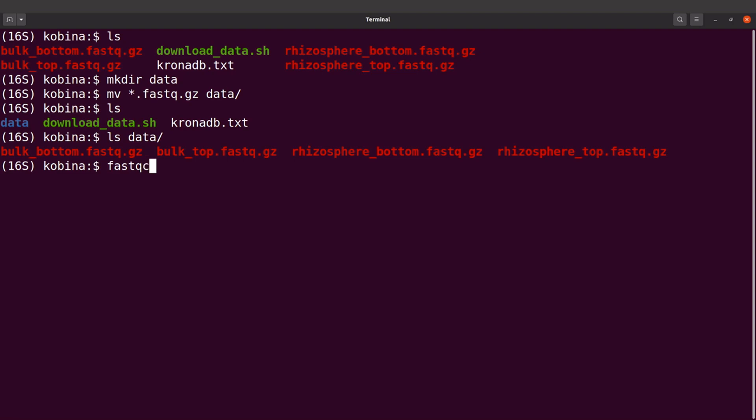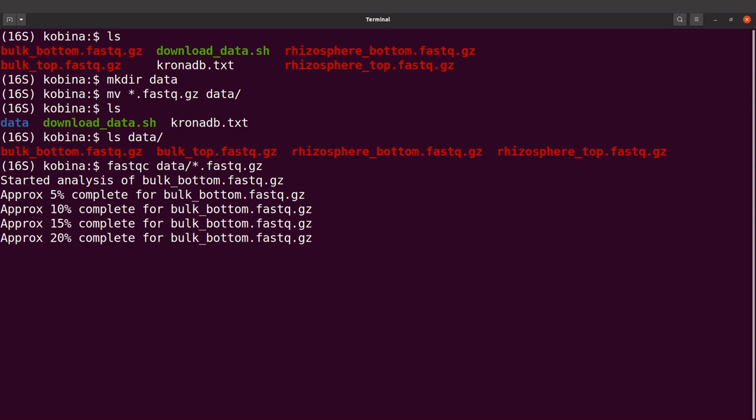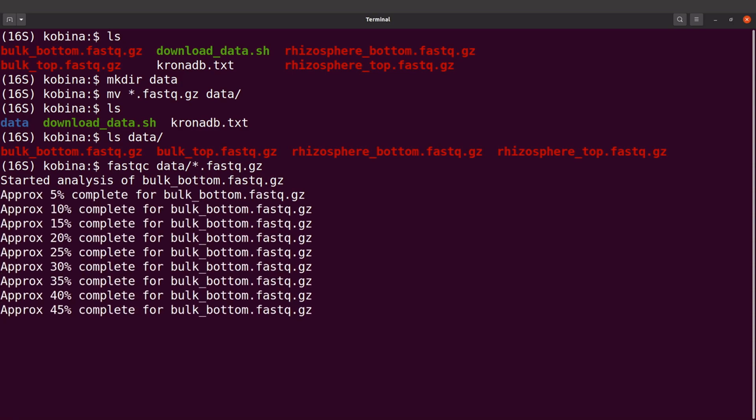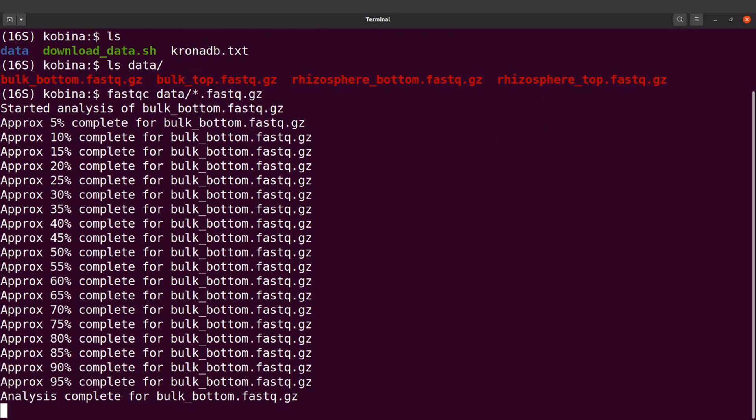FastQC and then we'll say data slash star.fastq.gz. Let's run this command. We can see FastQC has started performing the analysis, so it will do the analysis for all the files. Let's wait for FastQC to complete its work.